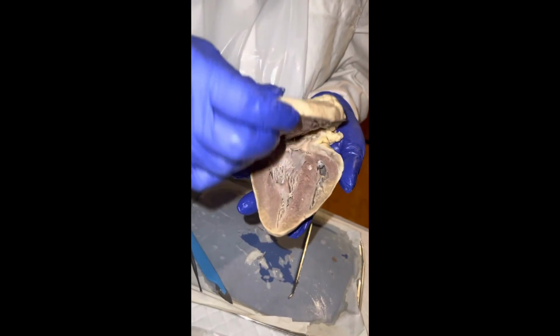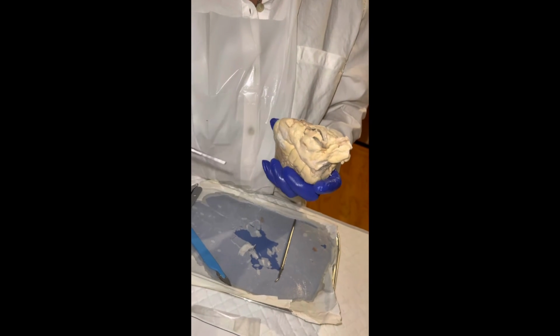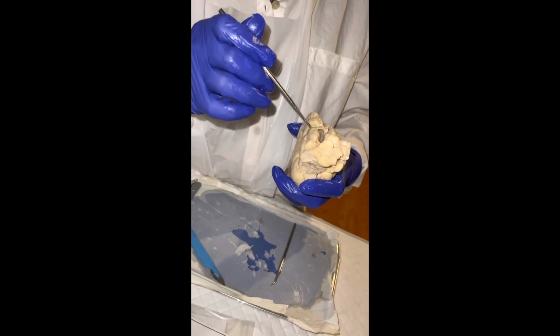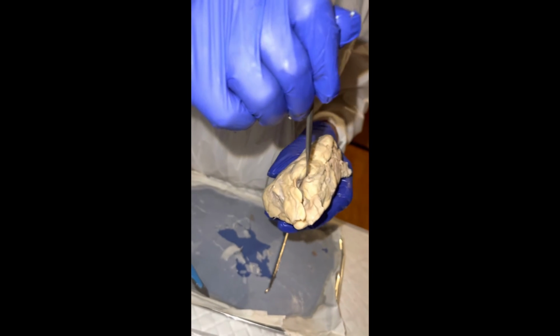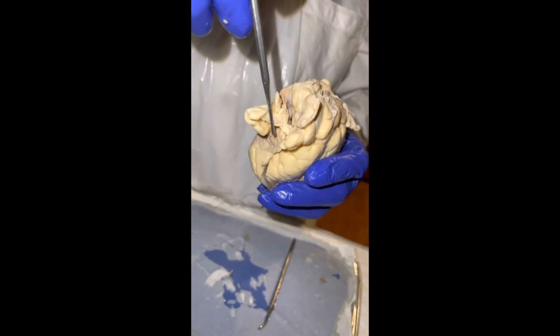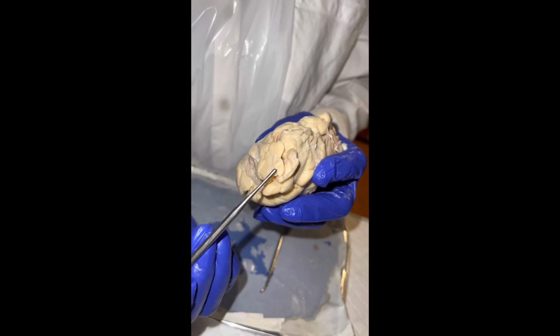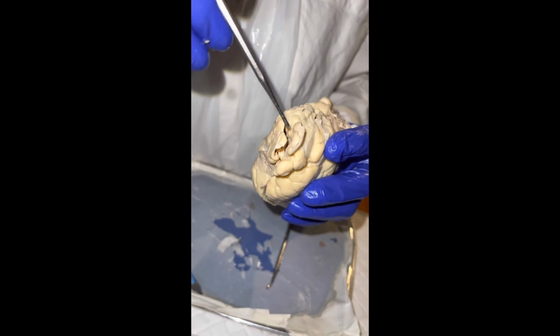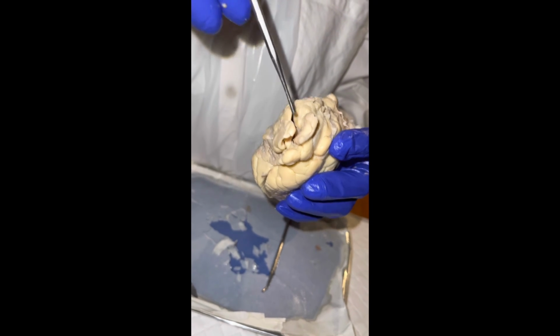Okay, now we are actually flipping the heart back over to discuss the inferior cava as well as the superior. So here in this general area is the inferior vena cava. And just on top here, if it were to be closed like before, this would be considered the superior vena cava.